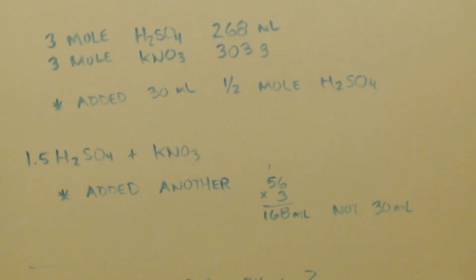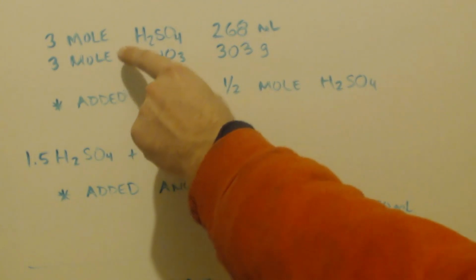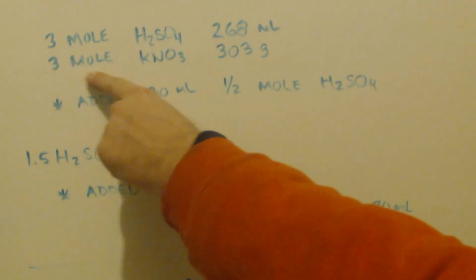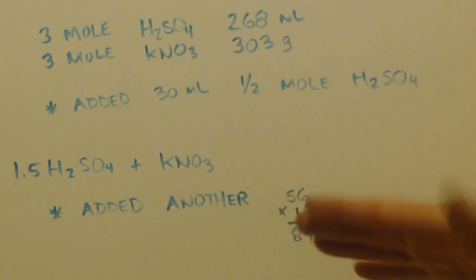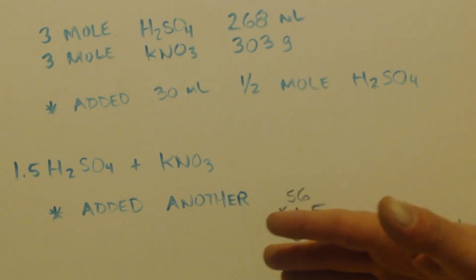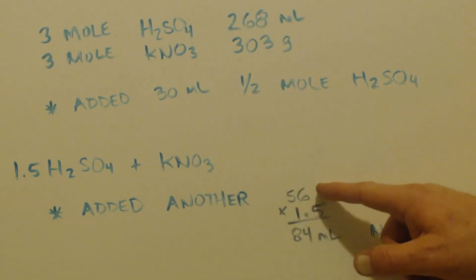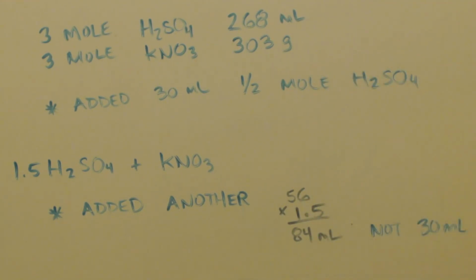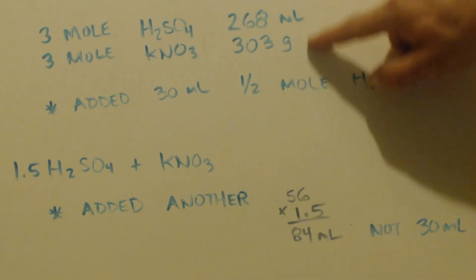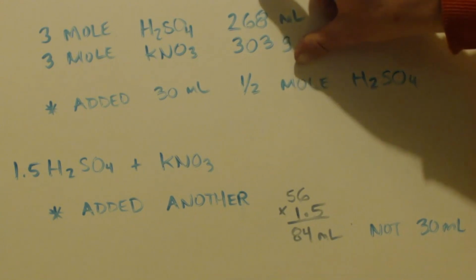Now, if you think about it, a 1 to 1.5 ratio would mean I would need 3 moles of potassium nitrate, and I would need 1.5 times that, 3 moles. So 1.5 times 3 is 4.5 moles. I only put 3 moles in. I should have put another 1.5 moles in just to get the 93%, right? Now 1.5 moles of sulfuric acid is 84 milliliters. So just to get the 93%, I needed to add an additional 84 milliliters of sulfuric acid.